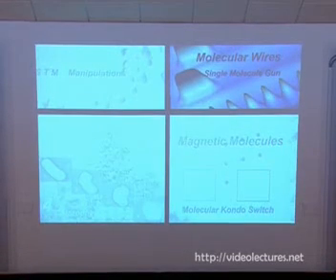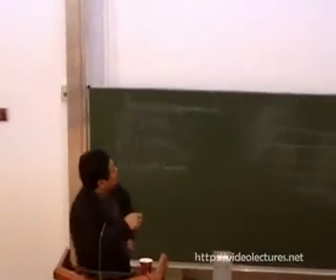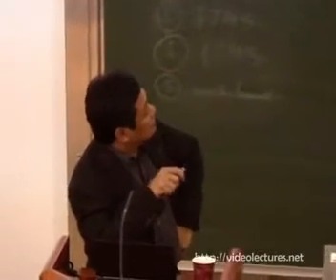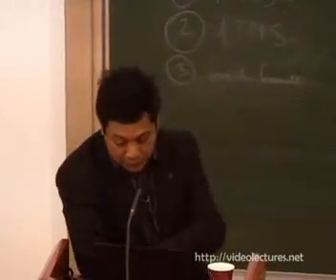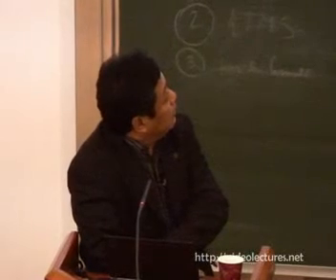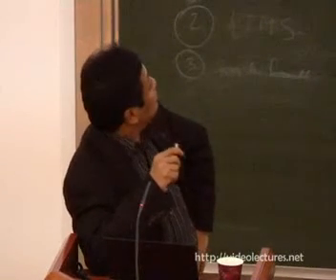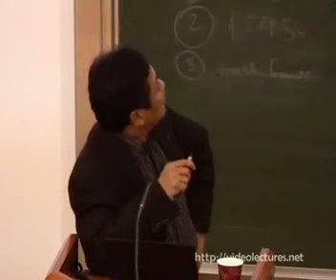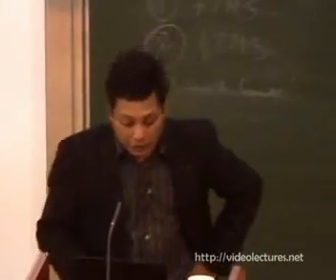Okay, so now I will move on to the second part, which is now the molecules, molecular wires. And this is about sexiphenyl, which is basically six benzene rings connected like a chain. So we call it sexiphenyl, which means six phenyl rings. In the STM images, the molecule appears like this kind of cigar-shaped device. Now we can play around with all the manipulation techniques to study these molecules.